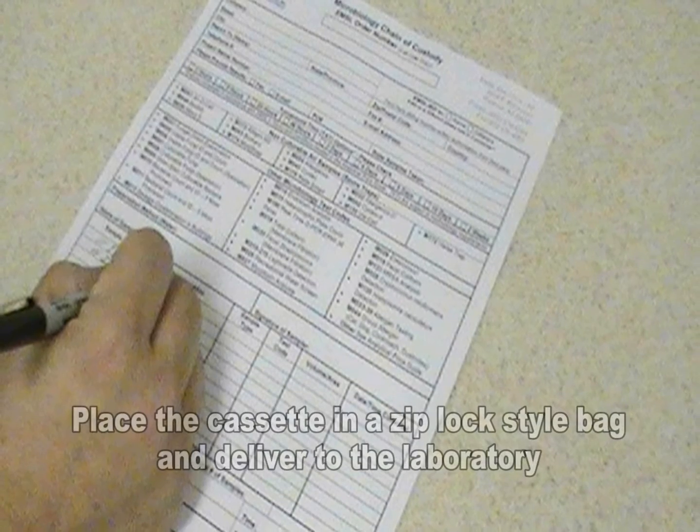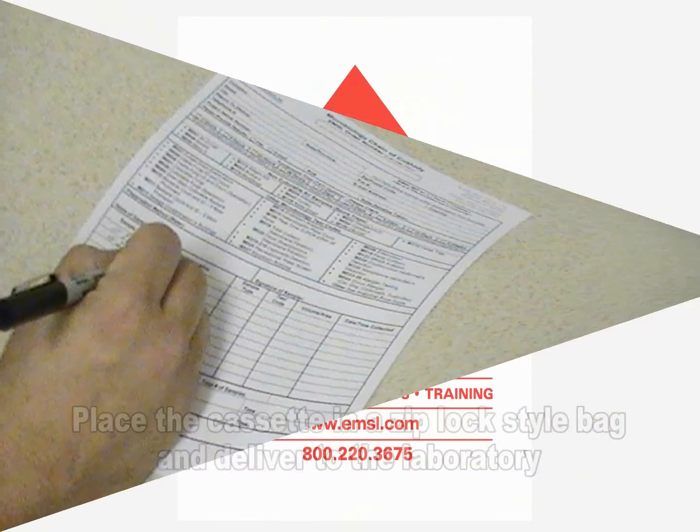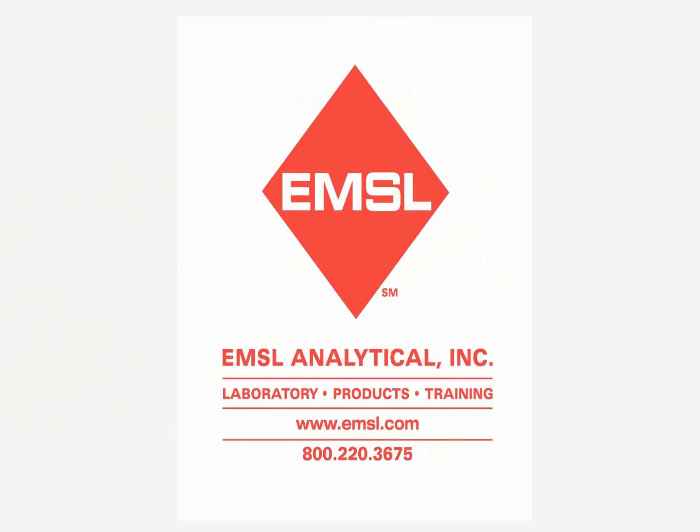Then place the cassette in a Ziploc style bag and deliver to the laboratory for analysis. To learn more about the MoldView Plus, contact EMSL Analytical.